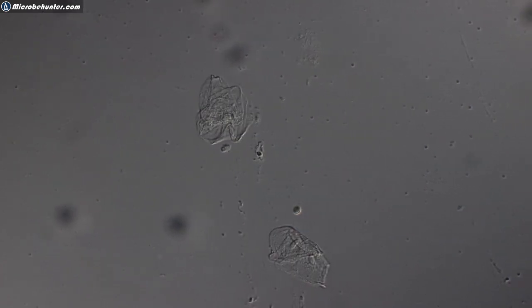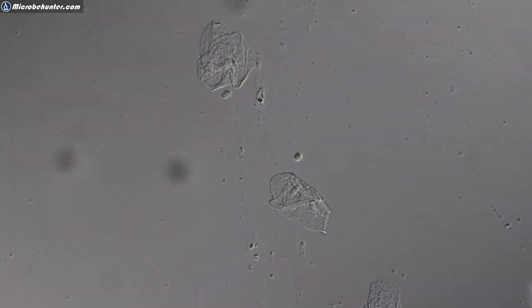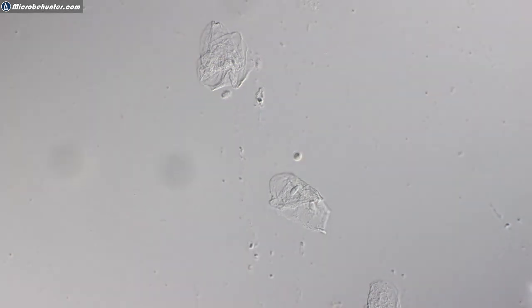Here, it's a second one over here. Still a little bit too dark. Need to go up a little bit and let's open the condenser a little bit. And you see that it will give you a slightly three-dimensional appearance. So it is similar to oblique illumination. So if you have a bright field microscope with a filter holder, try oblique illumination. Put a dark field patch stop into your filter holder and then rotate or swing out the filter a little bit so that the light strikes the specimen from the side. Then it will look quite similar.